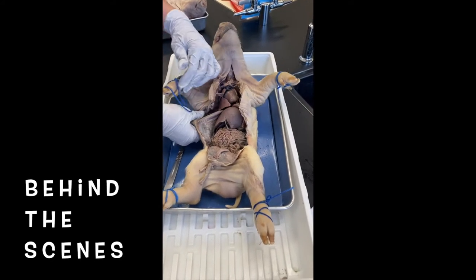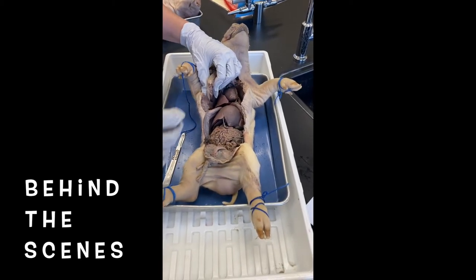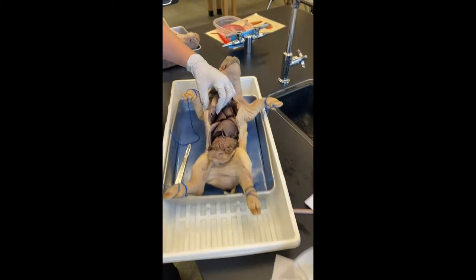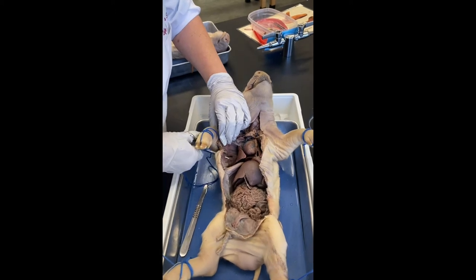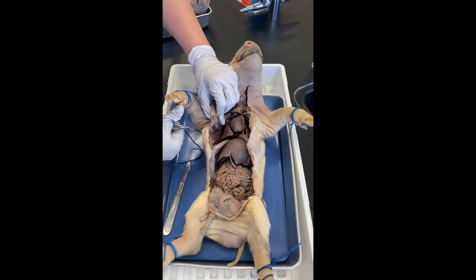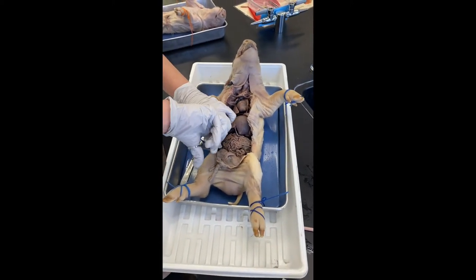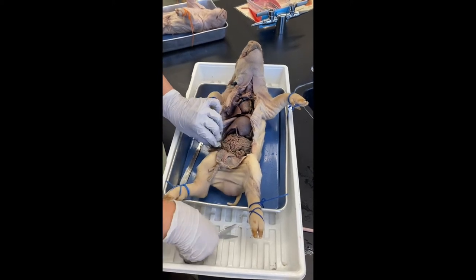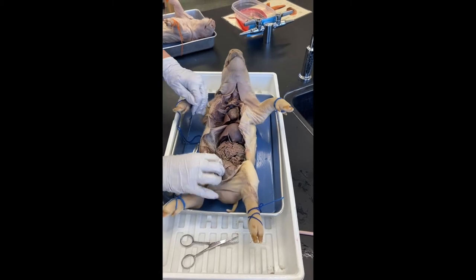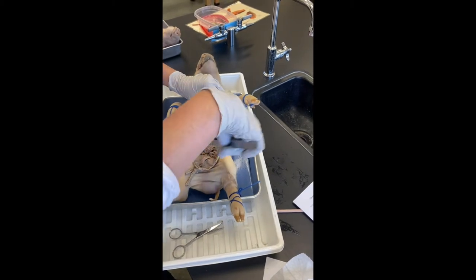Behind the scenes, this is a process that can take a while. And some of you would probably be good surgeons, or even better than I am, and people who have actually dressed animals before, you're watching me going, Miss Harrington, I could do better. I'm sure you could. But this part of getting the animal or the pig open so that we actually can view everything takes a while. And it's really important, because if the animal's closed up, it's very difficult.